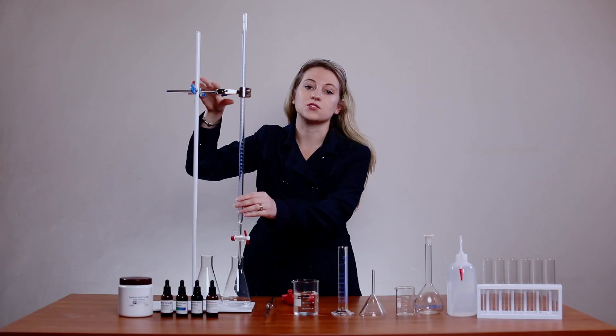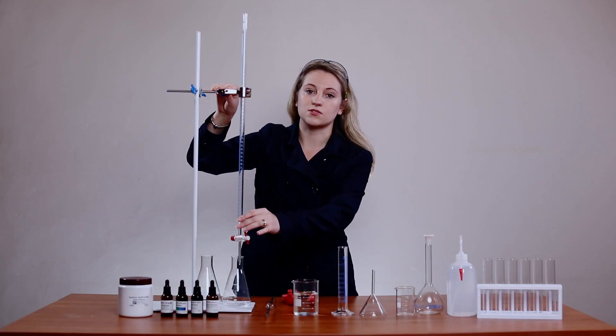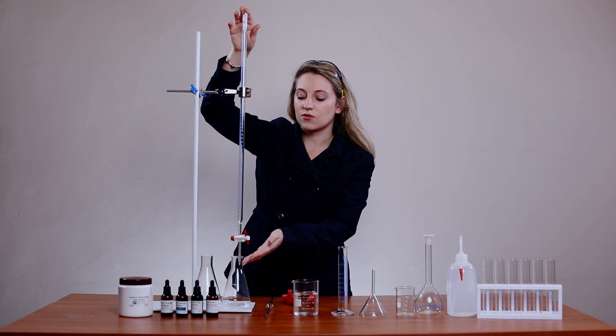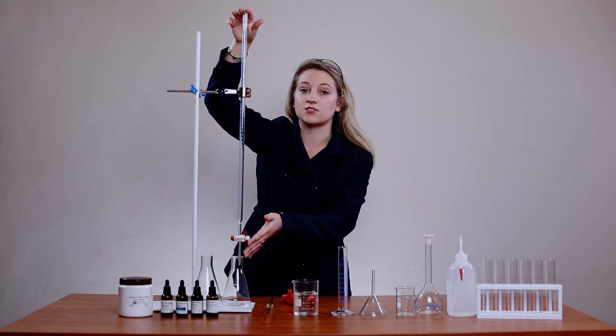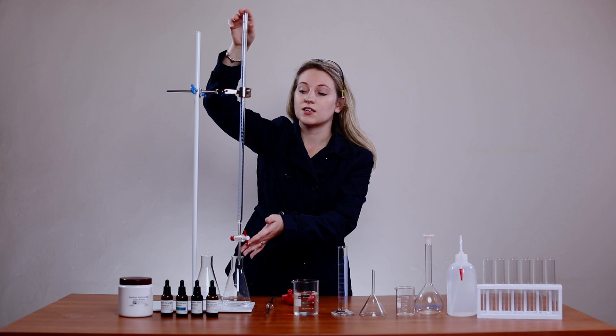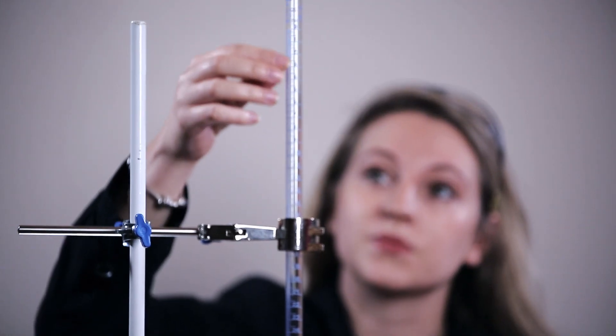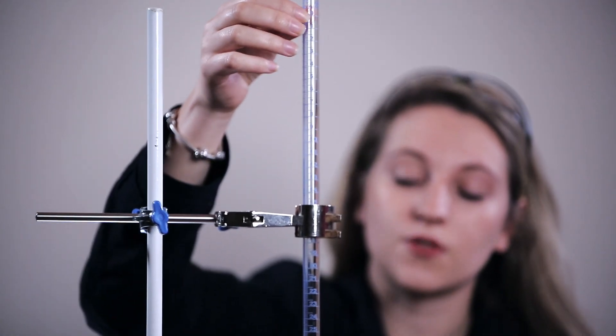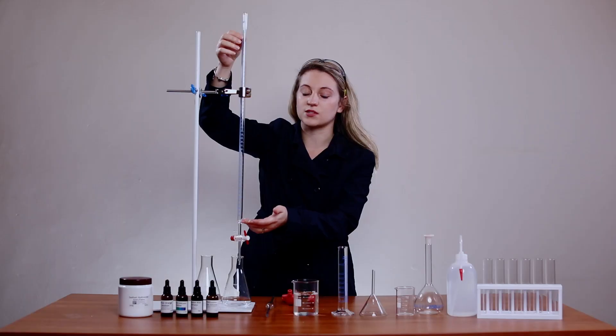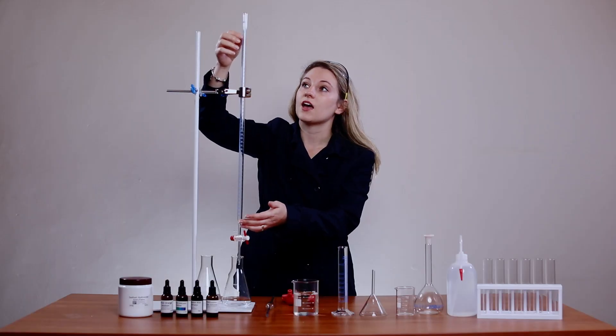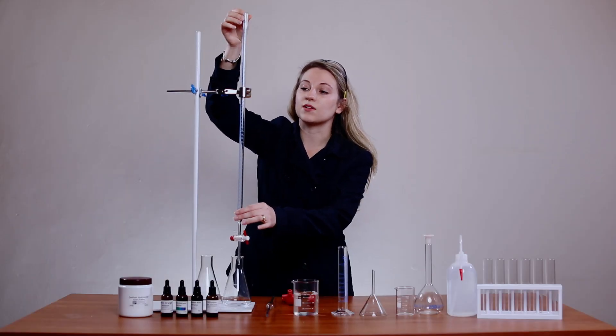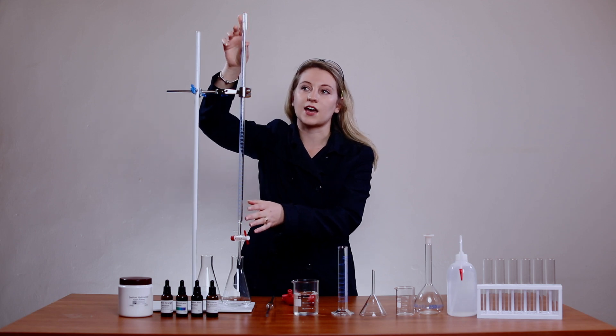One of the most important elements that you need in a titration is your burette. You will see that your burette is marked down from zero cubic centimeters all the way to 50 cubic centimeters.